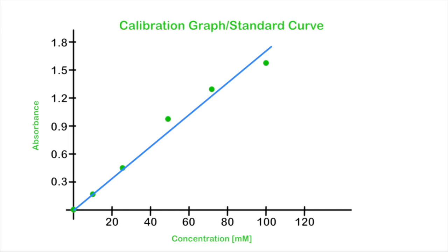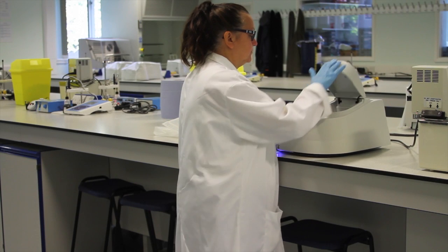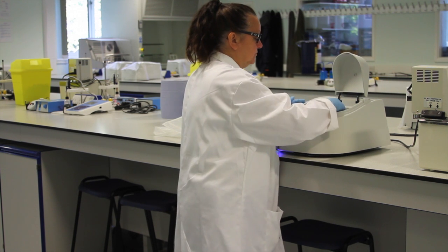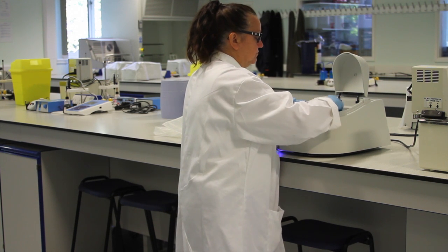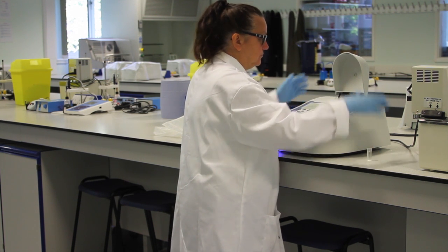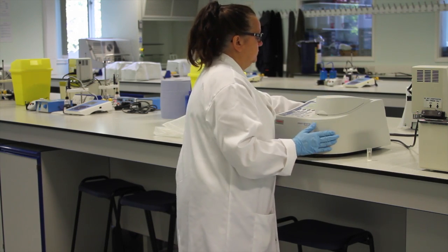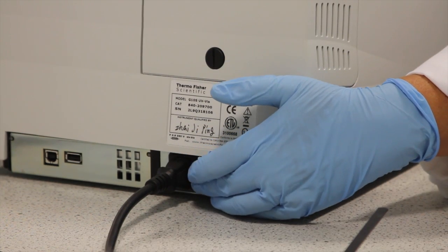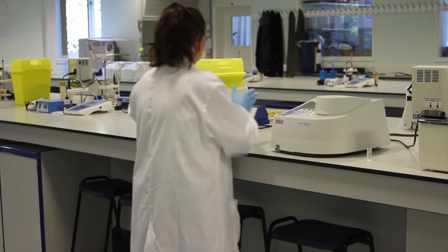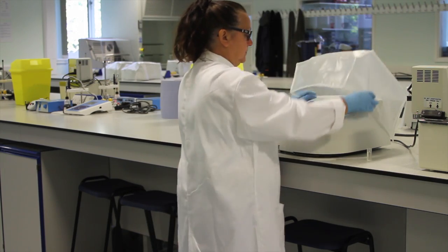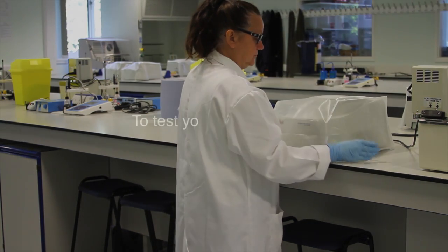For more information on calibration graphs, see the lab schedule and other videos in this series. Once you have finished, you should remove all cuvettes from the spectrophotometer and rinse them out with deionised water. Make sure you turn the machine off and replace the dust cover when you are finished. To test your understanding, please complete the short quiz on the KLE. Thank you.